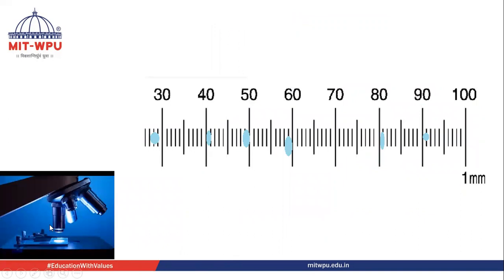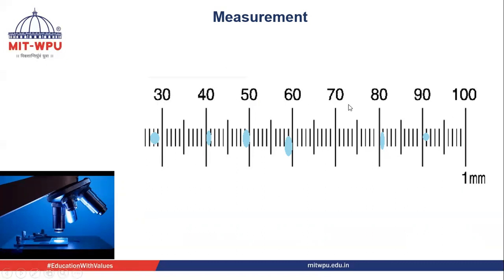Now I have removed the stage micrometer. Once calibration is done, remove the stage micrometer and place the prepared slide on the stage. We observe through the eyepiece micrometer. Now we can see only one scale since the stage micrometer has been removed and the prepared slide is in place. We can see the starch grains — blue in color — and the eyepiece micrometer scale. The scale can be moved as per direction or as per the position of the starch grains.